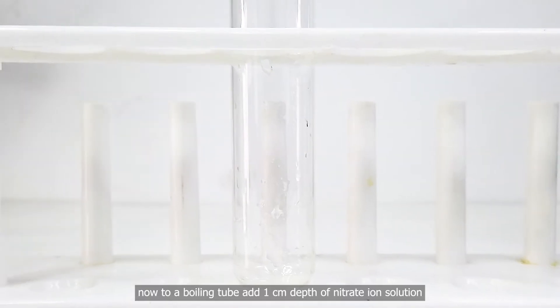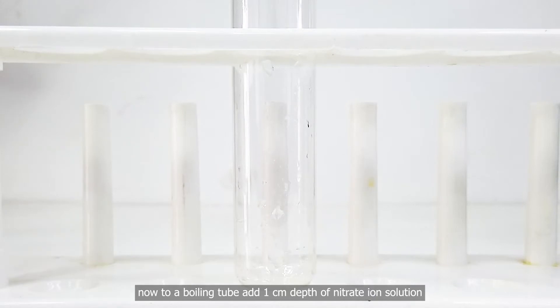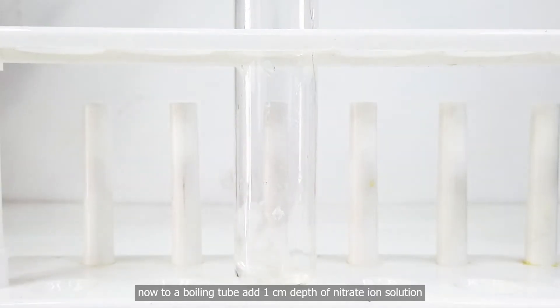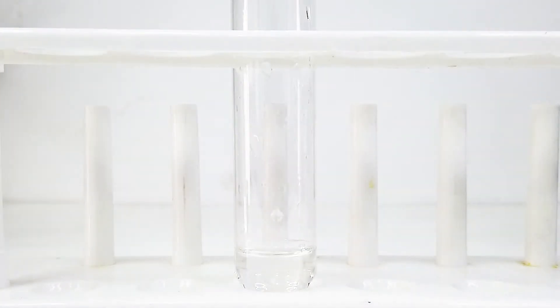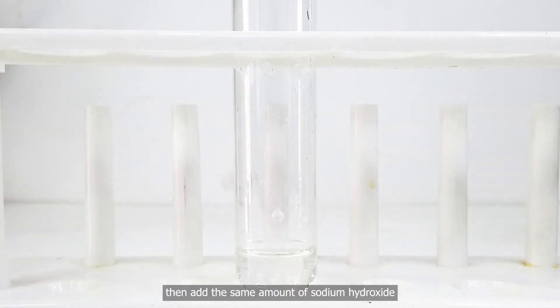Now, to a boiling tube, add one centimeter depth of nitrate ion solution. Then add the same amount of sodium hydroxide.